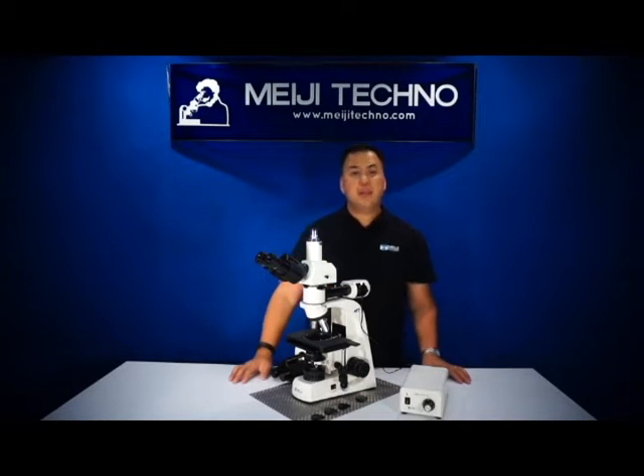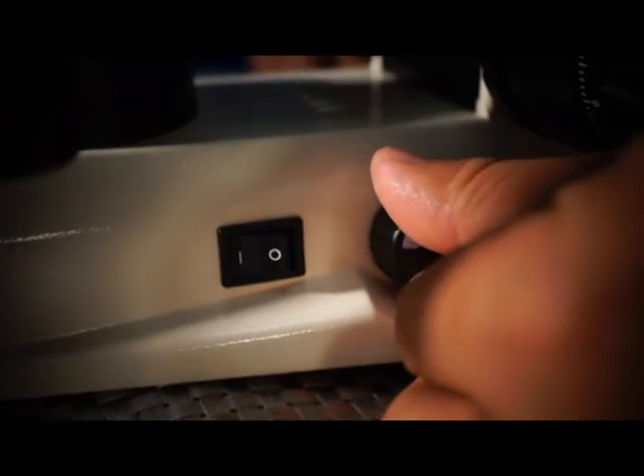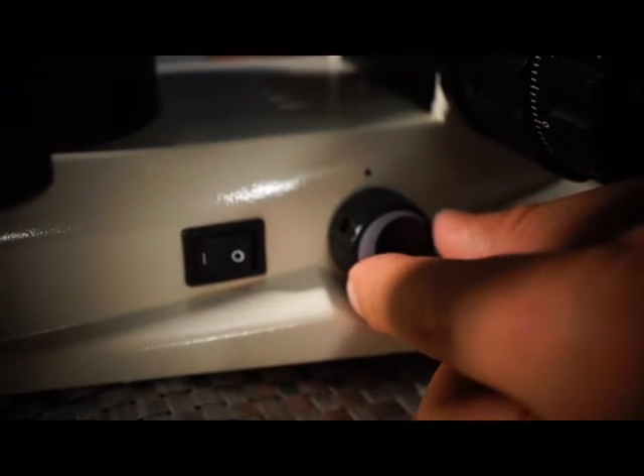The MT-8000 has an automatic voltage sensing power supply and a variable rheostat control built into the base. All you need to do is change your cord in back to a 220 cord and you can use it with 220 power.